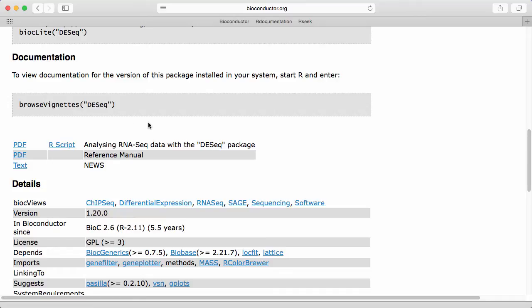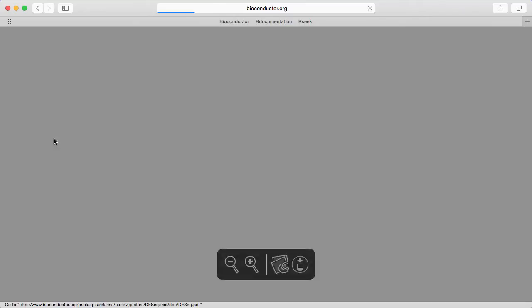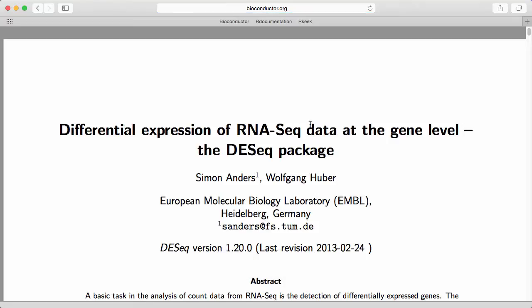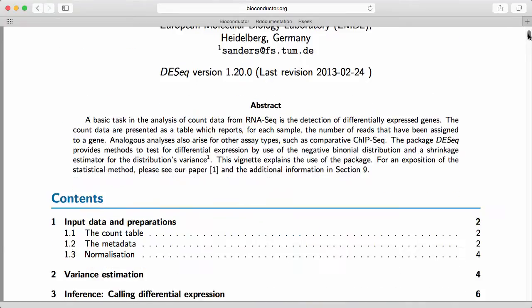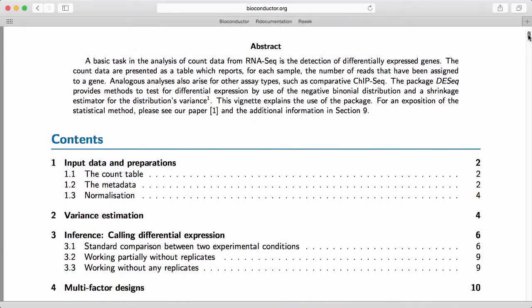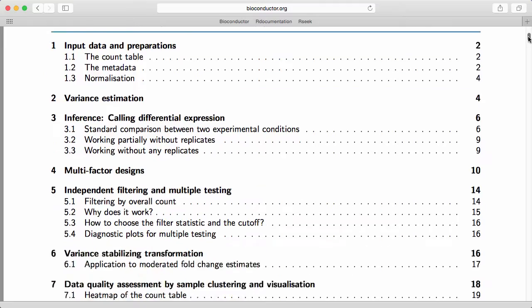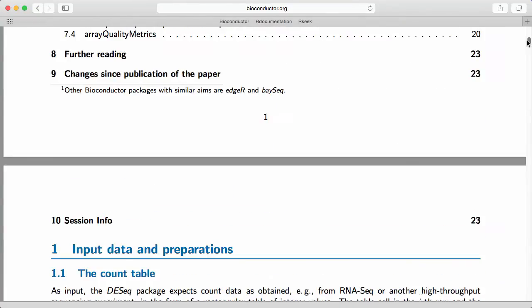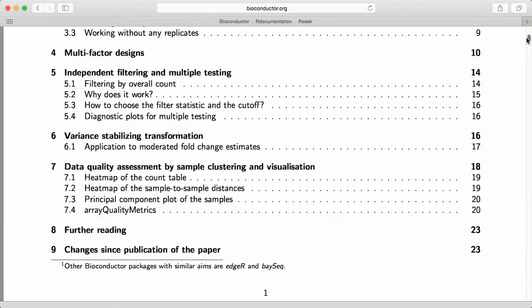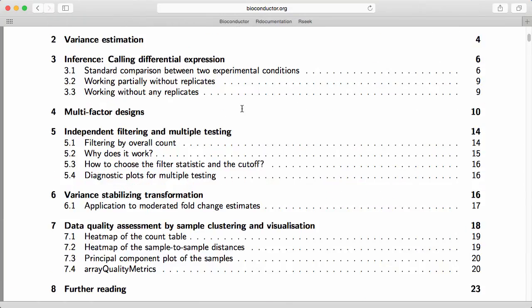In this case there's a single vignette and let's click on the PDF here where we get taken to a long description about what the package does and how to use it. We won't really cover it right now but you can see here in the contents that the vignette is roughly 23 pages and has a lot of important information.